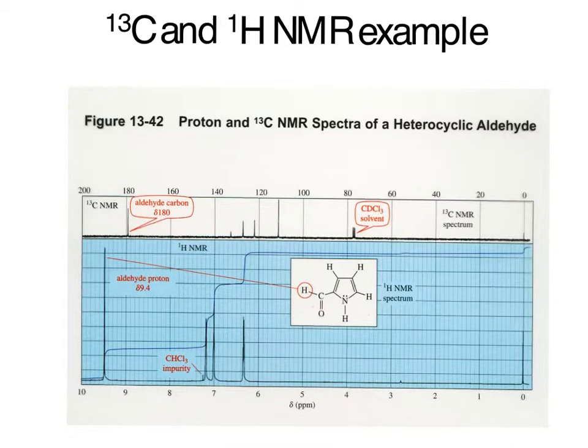So we take another example, and we are going to look at this molecule right here. And so we know we have 5 different protons. It turns out that some of these are going to be located underneath each other, but we have 5 different protons. We have the aldehyde coming out way downfield around 9.5. And then we have our 3 hydrogens here coming out in the aromatic region, and they're showing up here. Okay? And it turns out that our NH, we talked about that being exchangeable, it actually doesn't show up in our NMR. So that's the reason why we don't have that 5th proton there.